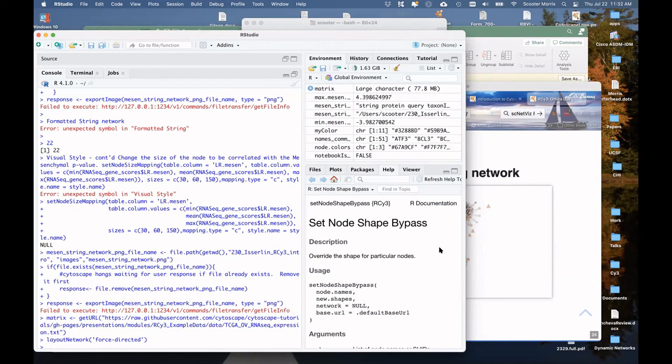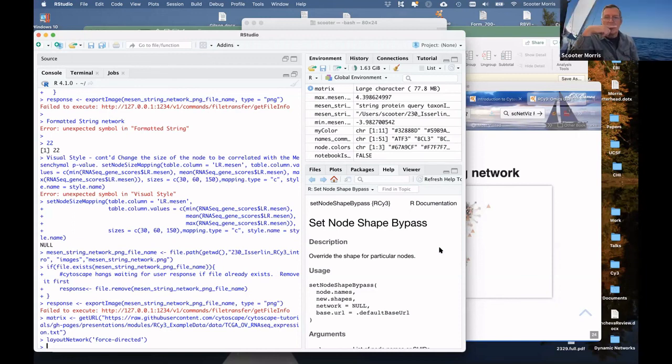I think the best way to do it is either of two ways. First, we can work in RStudio Cloud or just use Docker or something else, so you cannot do something and crash your RStudio. Yeah, I see the problem. It's difficult to do this in the cloud because obviously Cytoscape has to be local. Got you.